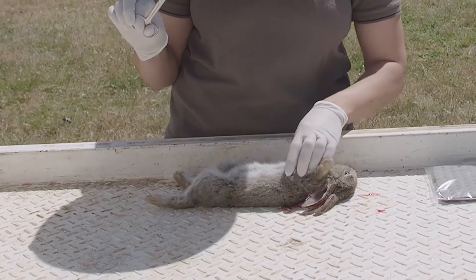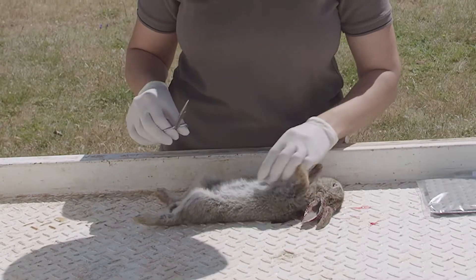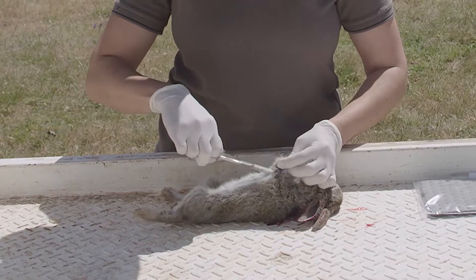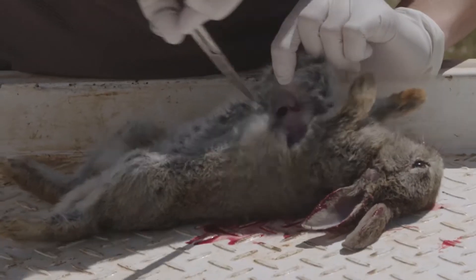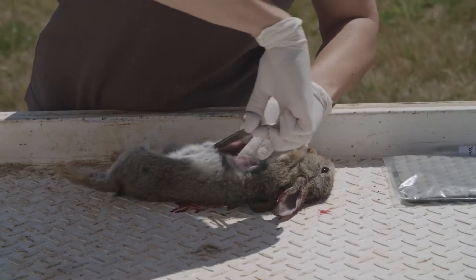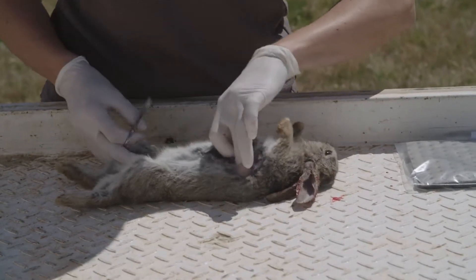Most people should have scissors handy, so I'm going to show you how to do this with scissors. You just want to pick up the skin and make a cut. Try not to cut the intestines because they smell.